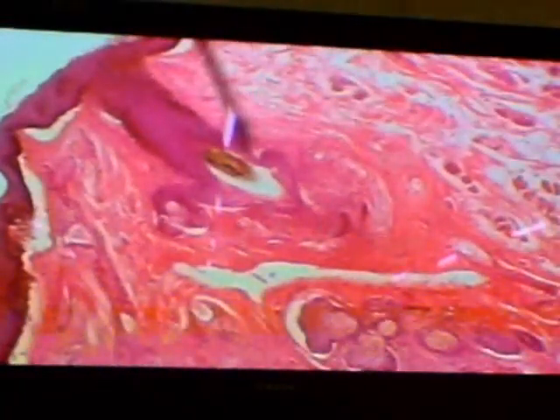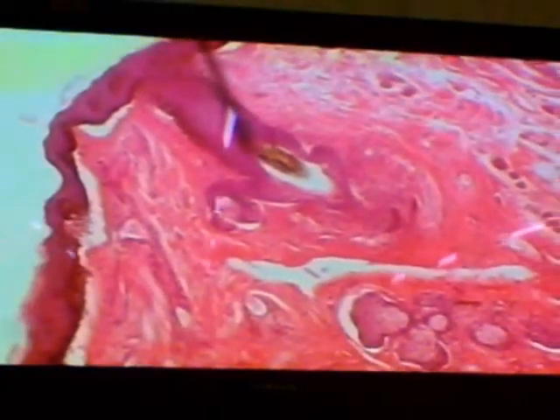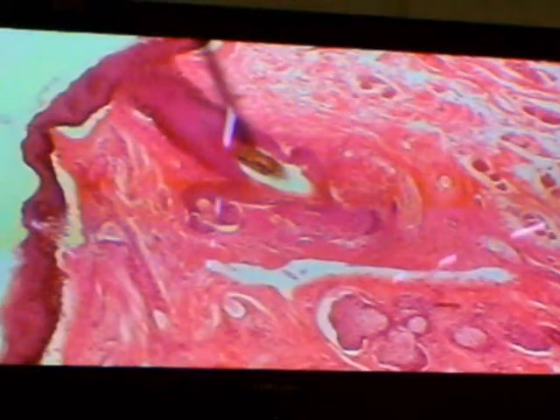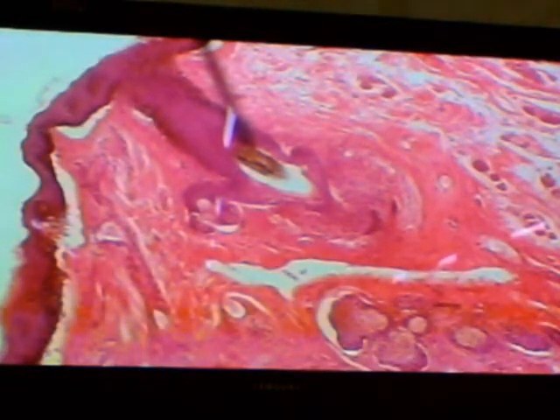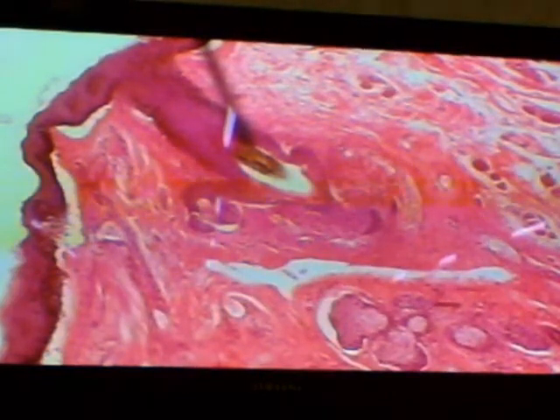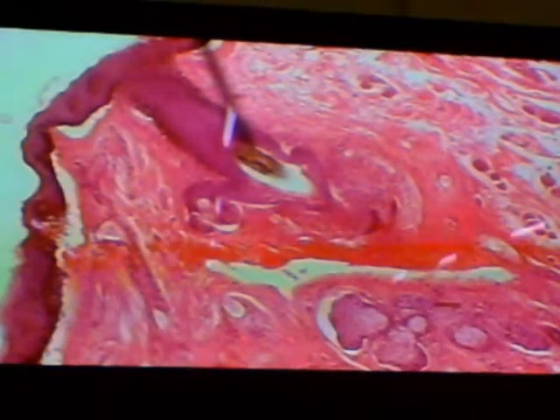If you look at this material here, if you look in the center part of it, it appears to be hollow, and the center itself is not deeply pigmented. So when you think of here, the color is really kind of peripheral, the pigmentation. Yeah.